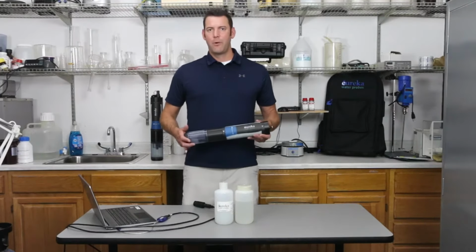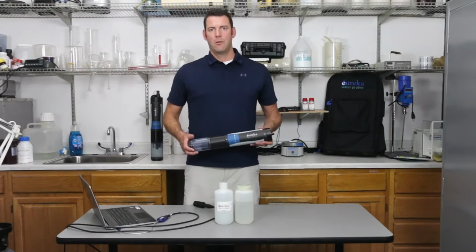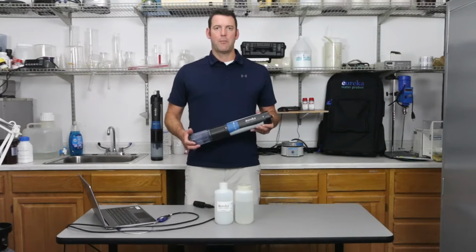Hello everyone. Today we're going to do another instructional video for you. We're going to calibrate our turbidity sensor on this Manta+30 multi-probe.